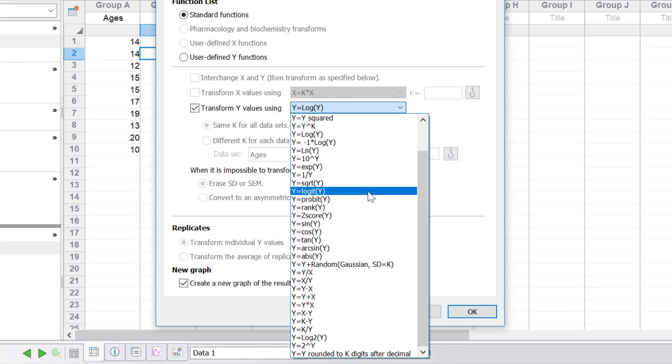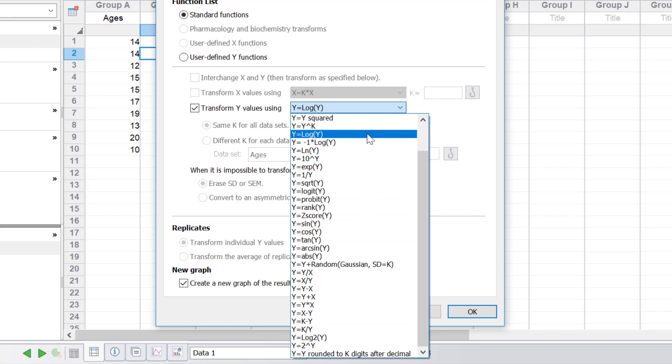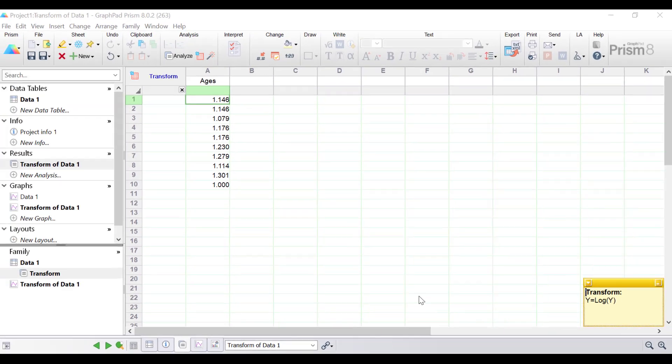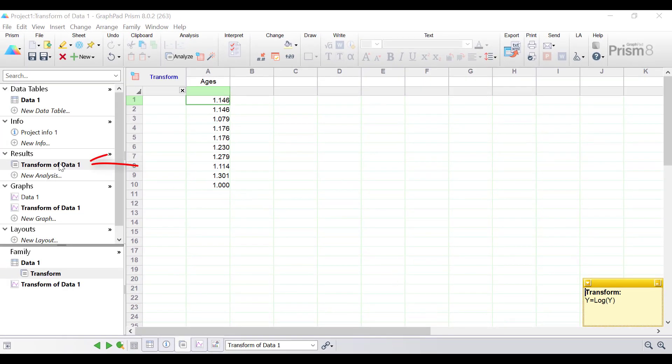For this purpose I'll just do a log to the base of 10 transformation. I'm going to select this and then click the ok button and there should be now a new result sheet.